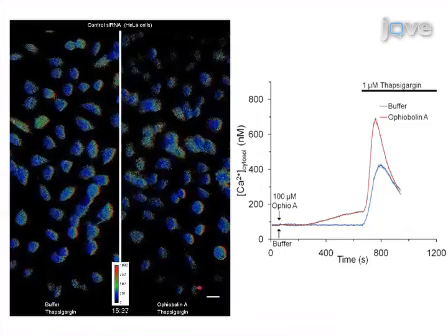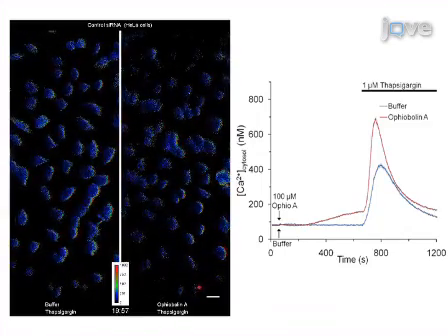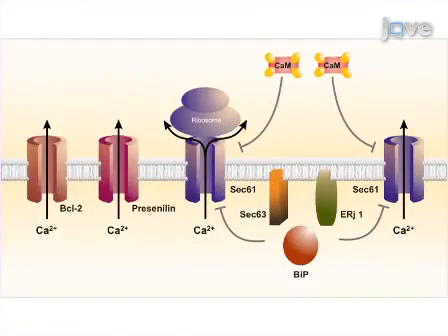Quantitative analysis of the resulting images reveals changes in calcium efflux induced by the silencing of Sec61A1. In this video, a model for the role of Sec61A1 in calcium efflux will be presented following demonstration of the procedure and presentation of the results.